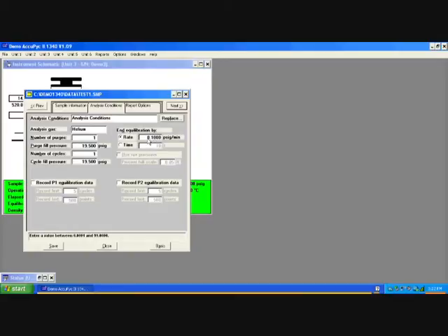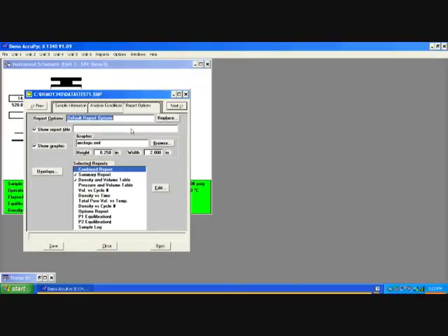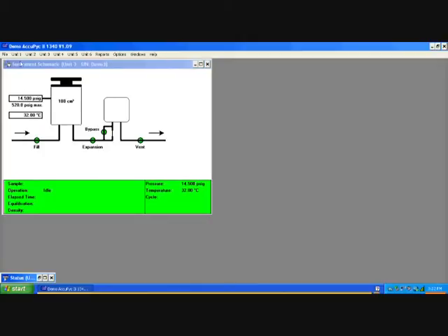Here's the equilibration rate, we'll set to 0.1 as we did before. We can choose the run precision again as you see, and even record P1 and P2 equilibration data. We can also choose the different report options. We'll save this, we'll close this, and we'll start the analysis.